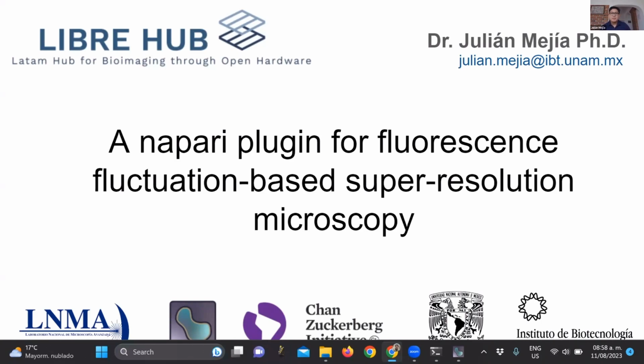Today I will talk about this plugin for superresolution, which is based on fluorescence fluctuation microscopy. And you were right, Tobias. Probably you will need specialized microscopes to get the image to process with this plugin, or not. That is part of the thing that I might trigger today, the curiosity. So this is my email. Please feel free to take note of it and send me any question or further support that you will need with it.